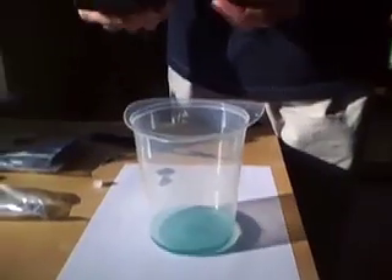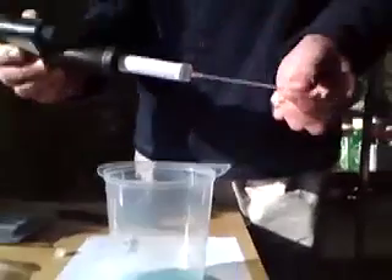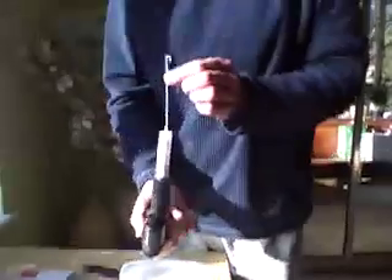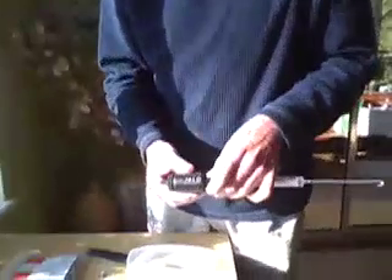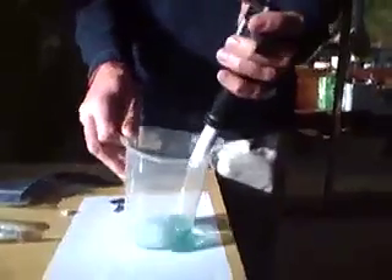So I've already set up the digital titrator, I've got the acid attached, I've got the little tube which feeds the acid, and I've expelled the air as I showed you first of all, so the acid will come out as soon as you start rotating the gauge. I'm going to zero the gauge so it reads 00000, and then swirling the water, I'm going to start adding the acid.